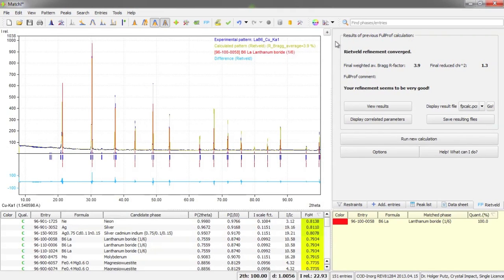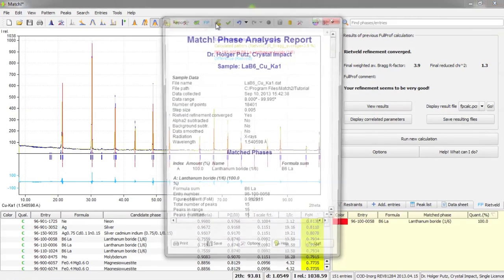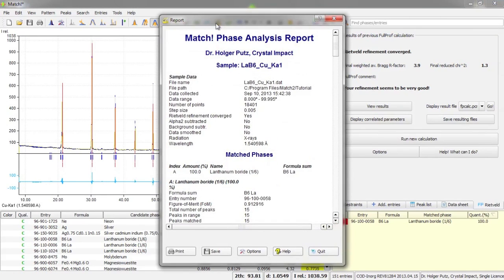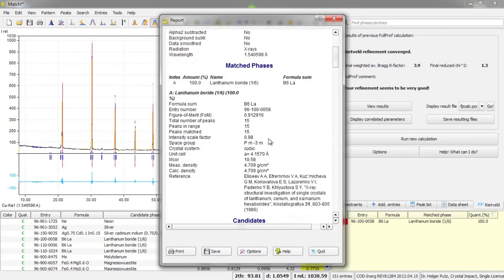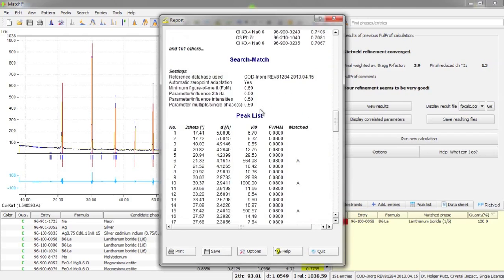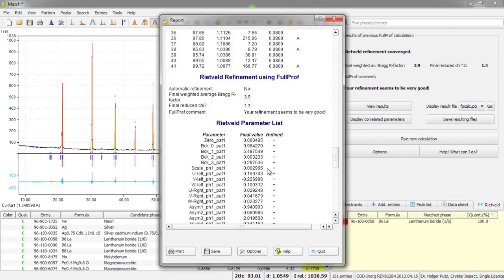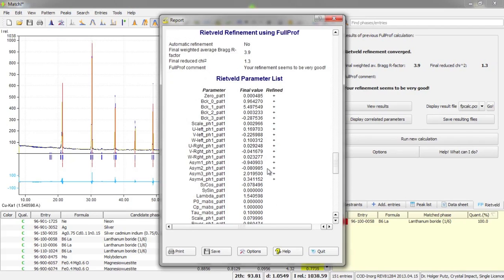Okay, finally I would like to draw your attention to the report of MATCH. Here you can get all the information about your diffraction data you have imported, the phases you have selected as matching, the candidates that were still present, the parameters that were used in the search match calculation, the peak list that was used and now that's new in the version 2.1, the Rietveld refinement results.